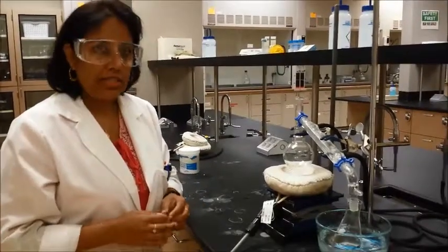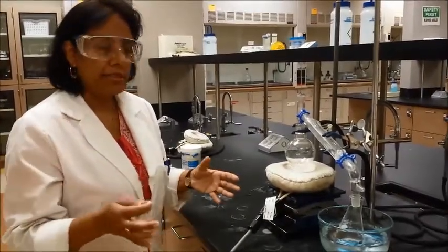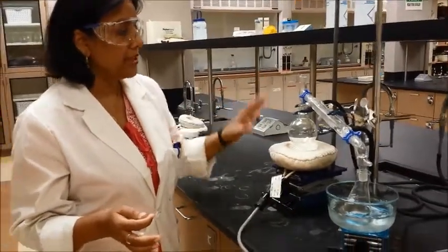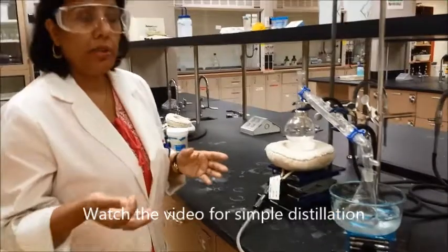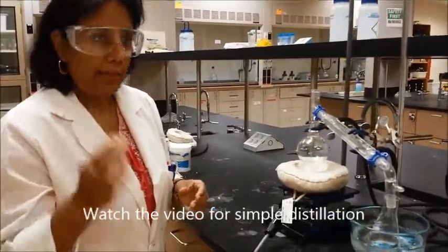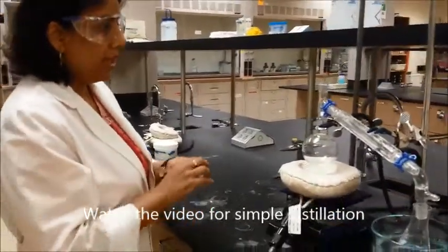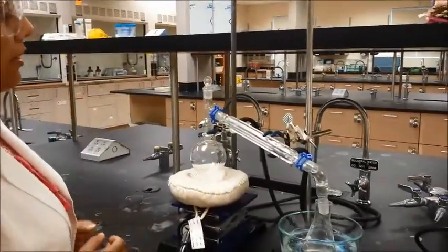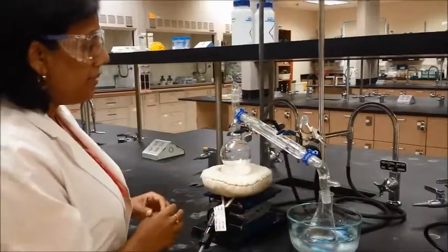Trying to set up for steam distillation — the setup is the same as a simple distillation, which means you will need the heating mantle, the rheostat, the condenser, and all that. The only thing you may not need is a thermometer, because you're not measuring temperature in steam distillation. You can go ahead and use a stopper in place of the thermometer. Everything else is the same.